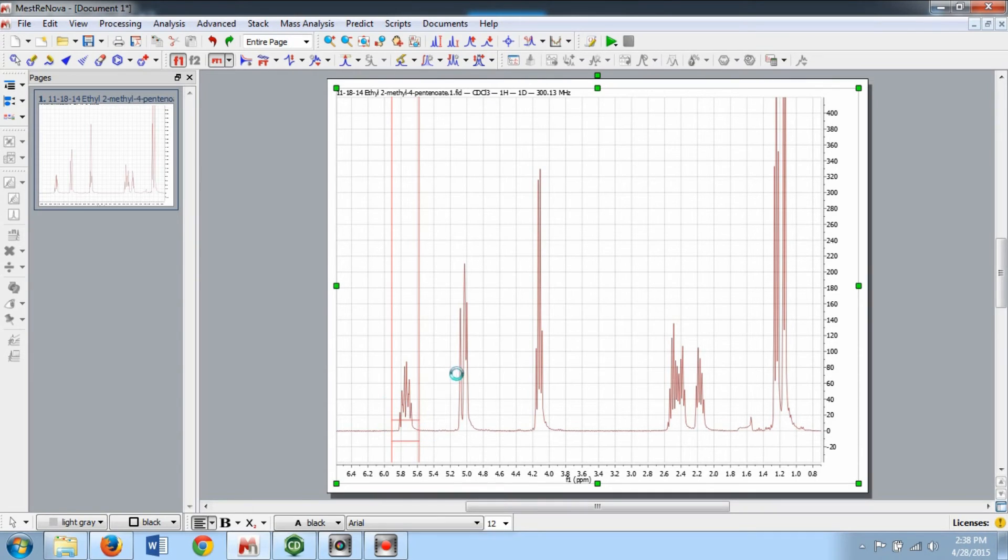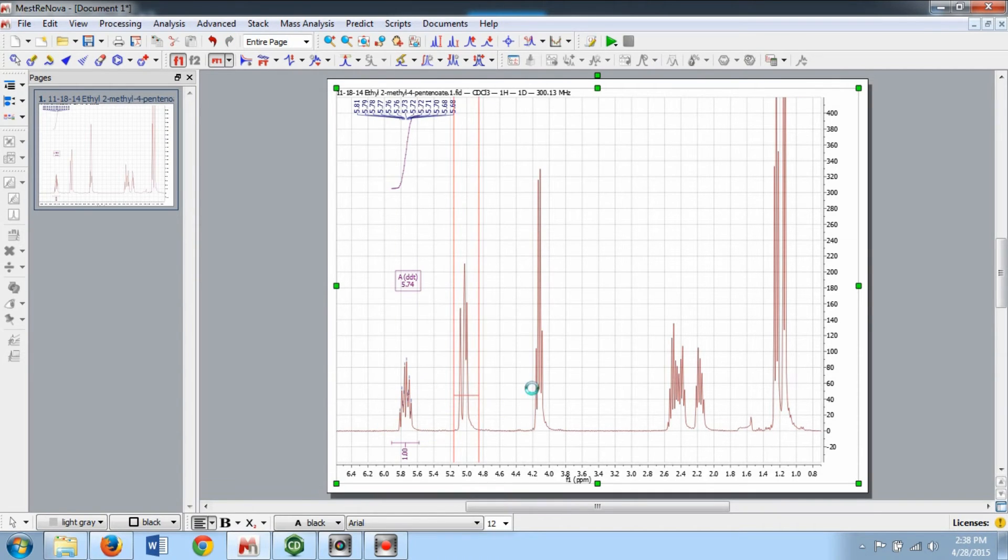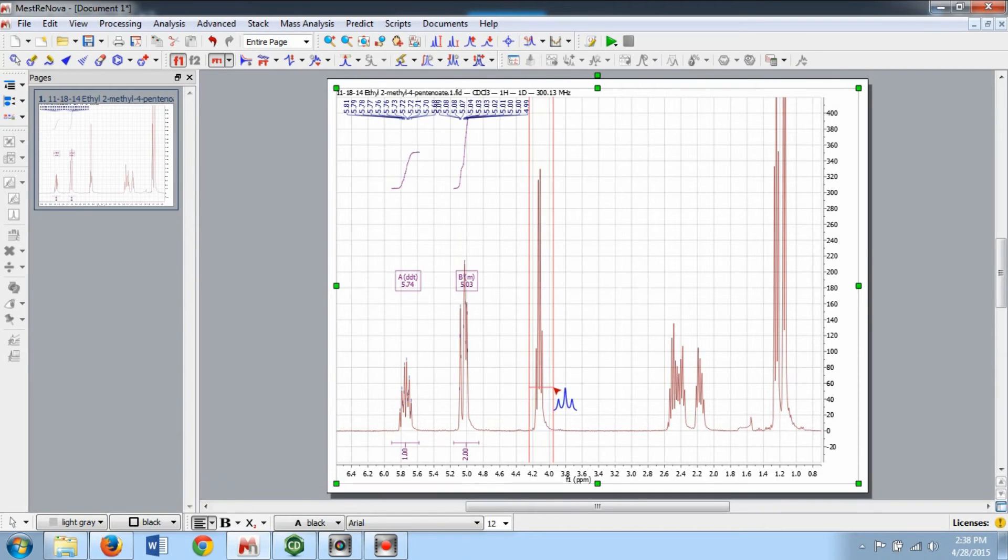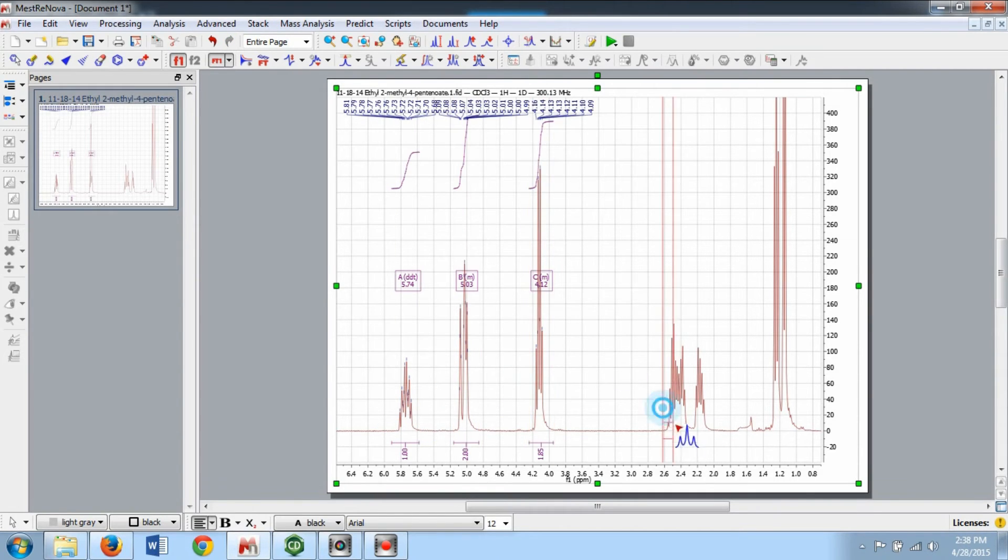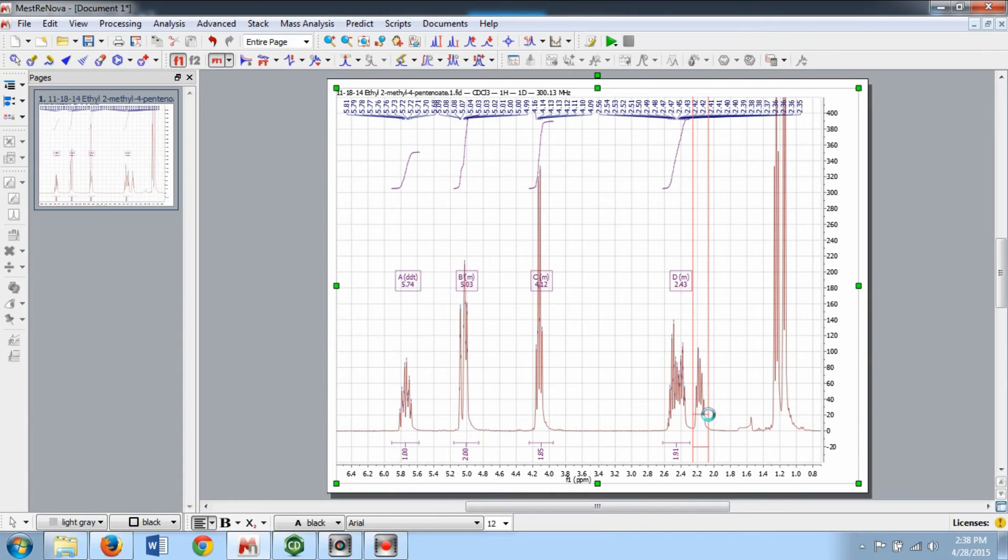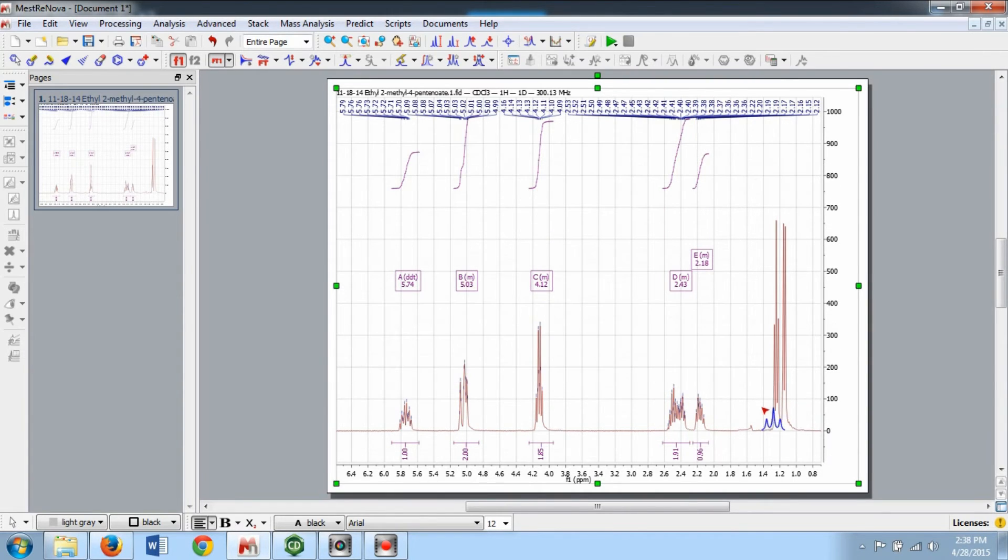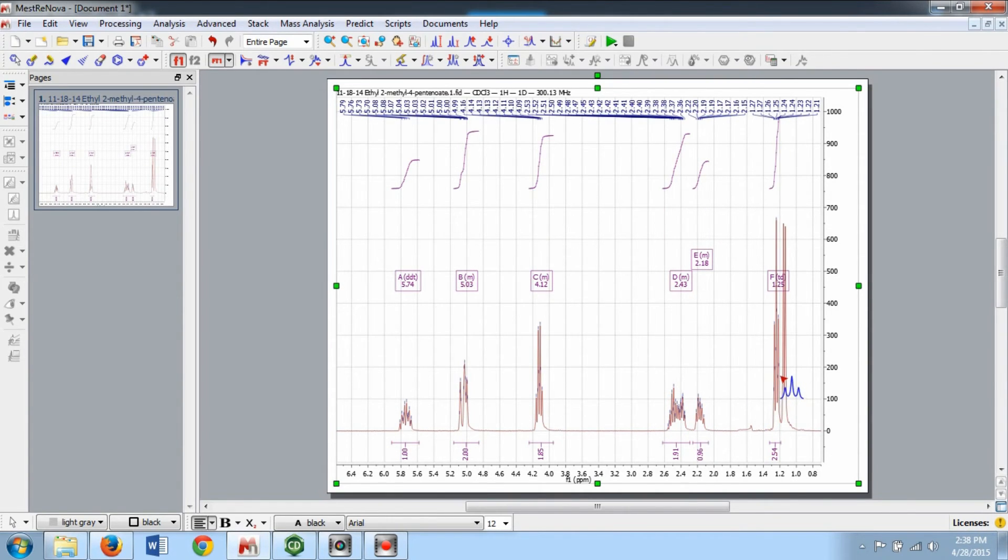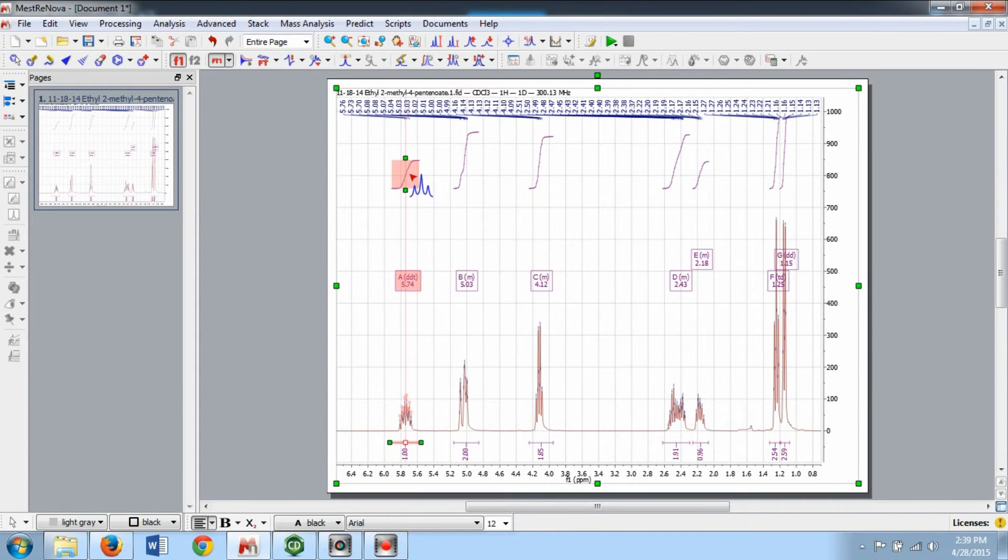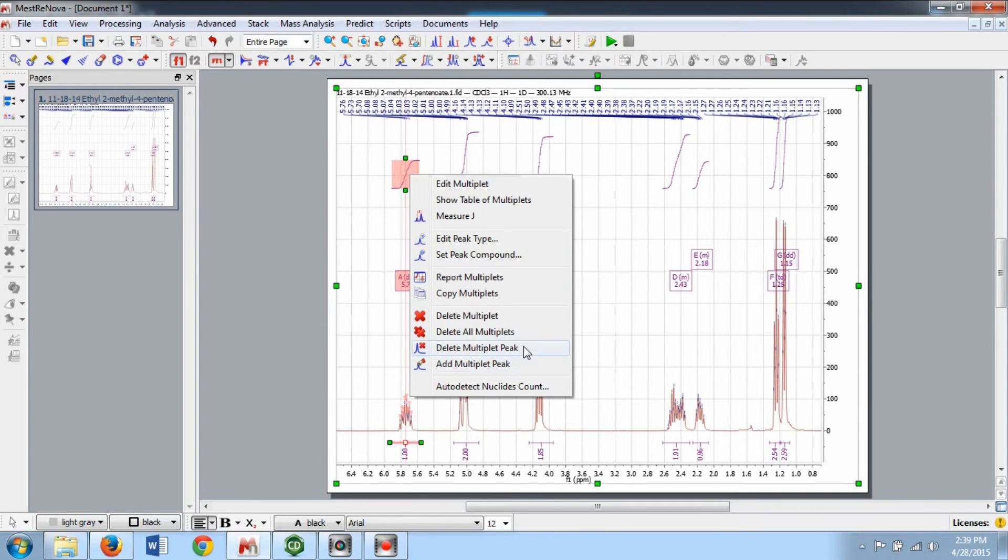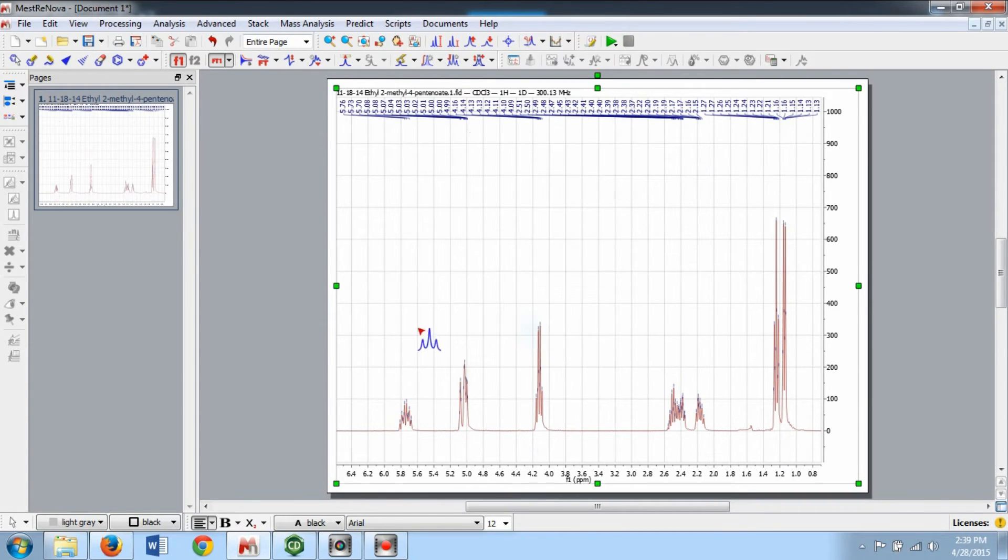Multiplicity can be determined with the Manual Selection mode in the Multiplet Analysis options. Using this mode, select the peaks you want to analyze, making sure that the peaks you want to analyze are above the red line. Alternatively, the Automatic Multiplet Analysis option will automatically analyze your spectrum. However, as previously mentioned, with the Automatic Analysis mode, you may analyze undesired peaks.